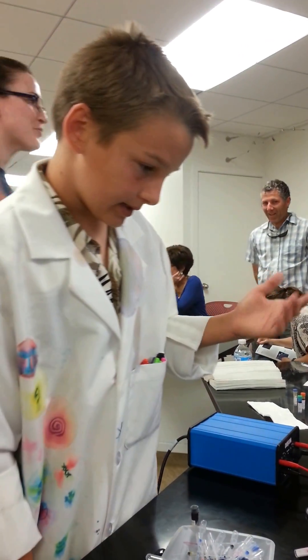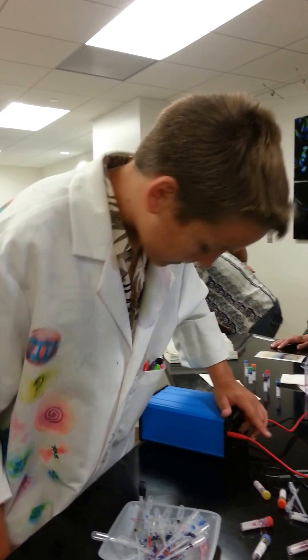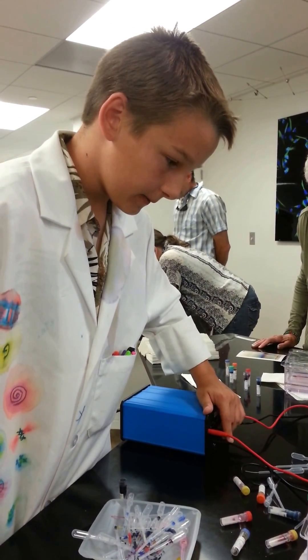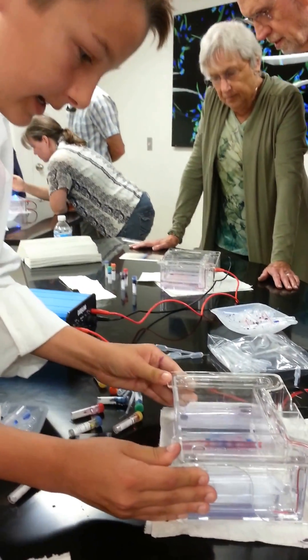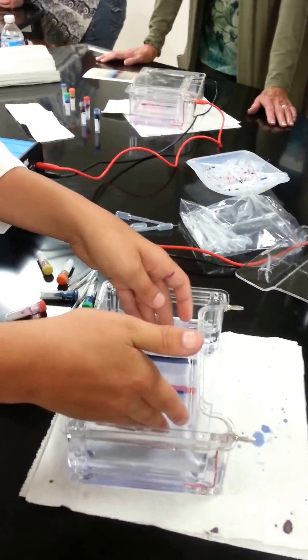Once we're done — it's about five minutes — we're going to finish it. So it's been five minutes, and now we're going to turn it off and take this out.